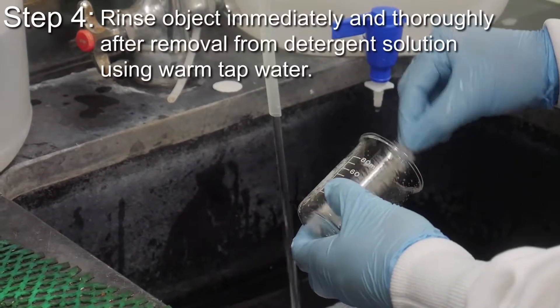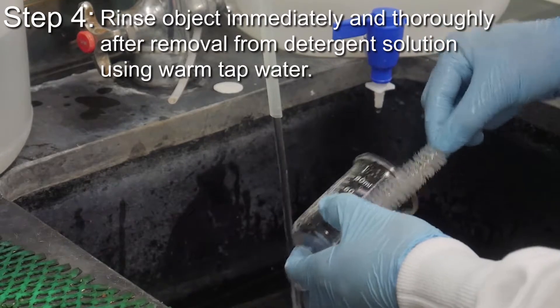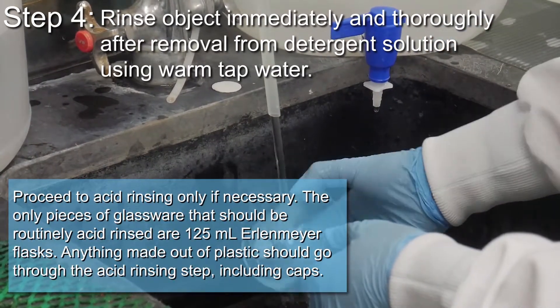Rinse object immediately and thoroughly after removal from detergent solution using warm tap water. Proceed to acid rinsing only if necessary.